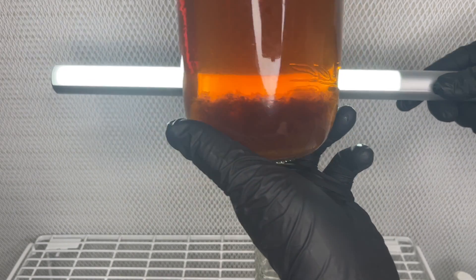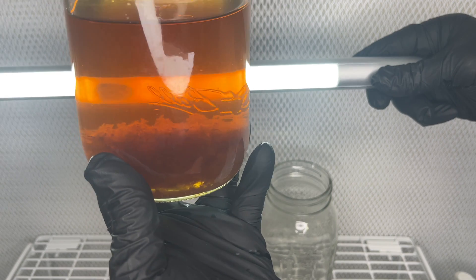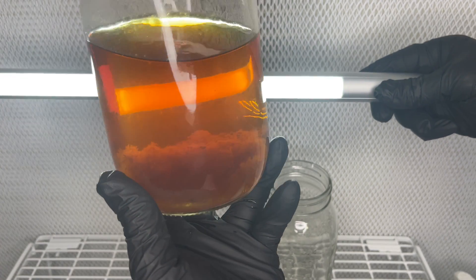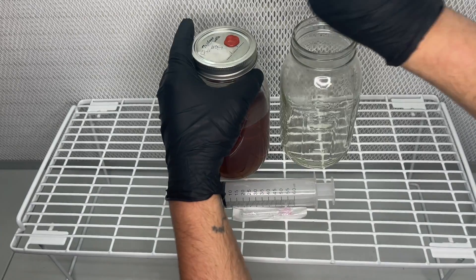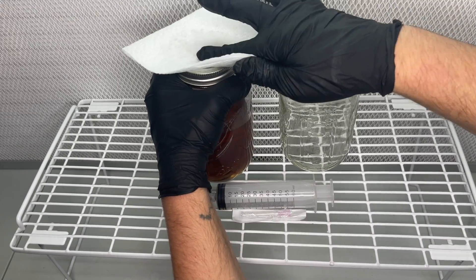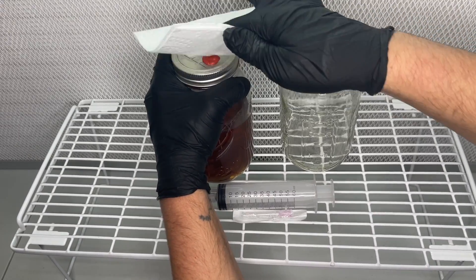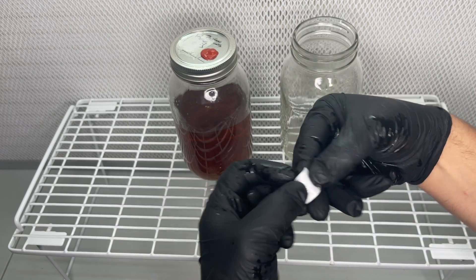I have made thousands of Lion's Mane Liquid Culture jars over the years and one thing I have noticed with many of the jars is the mycelium will stop growing around this point and turn the liquid culture a dark color.